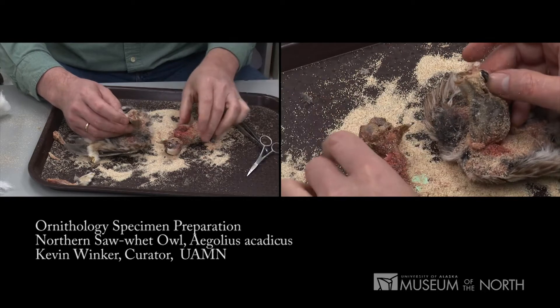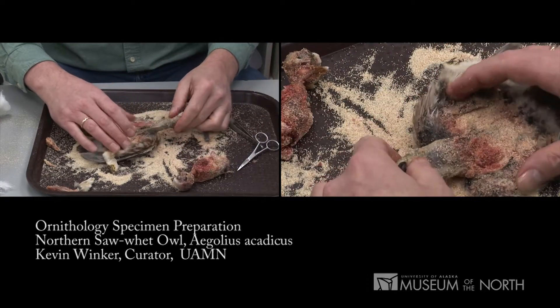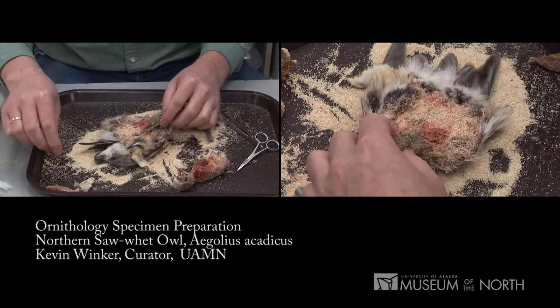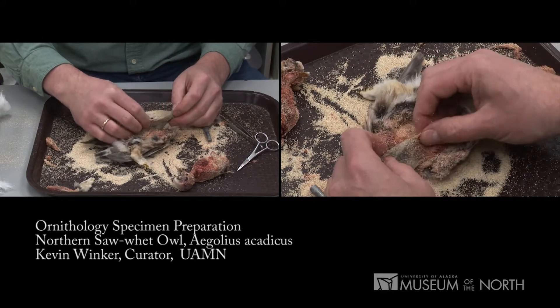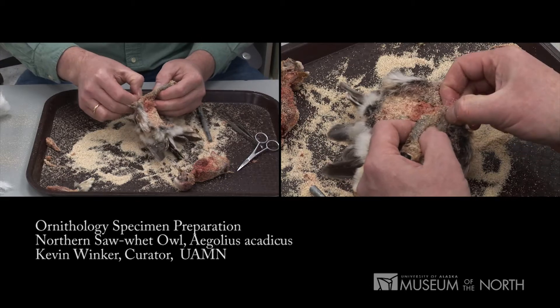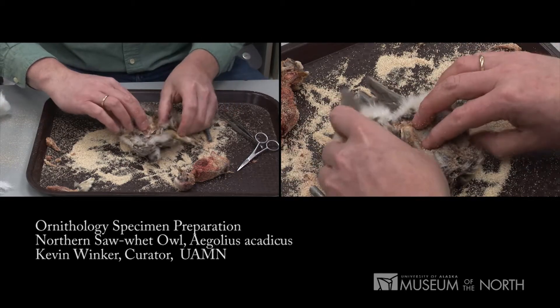I'm going to take some of that meat away. I'll set this body aside for just a moment. I need to make sure that I've got a skin that's not going to soak juices into the feathers and gum them up. There's a little fat I'm pulling away. It looks fairly clean.